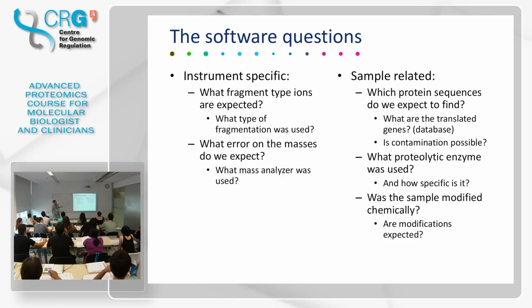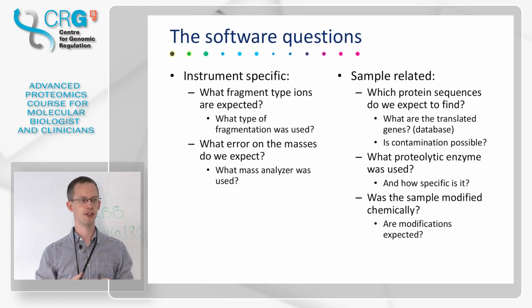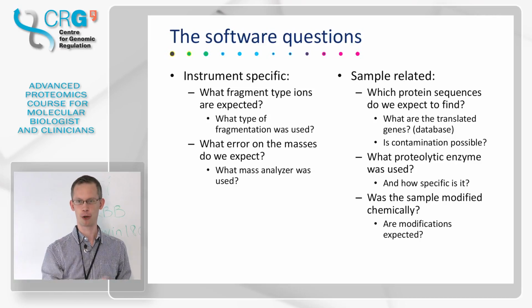OK, then there's a bit of sample-related questions. So for instance, which protein sequences do we expect to find? Essentially, many proteomic workflows use some sort of gene predictions, so essentially a database of the proteins that are in this sample that we're working with.